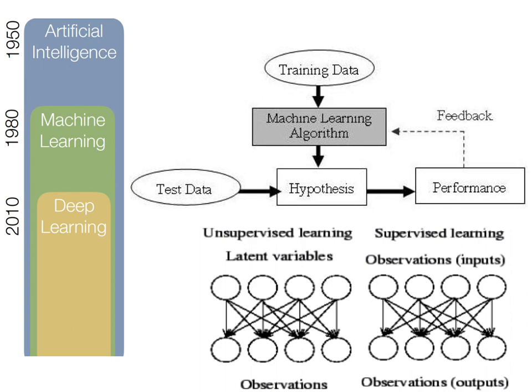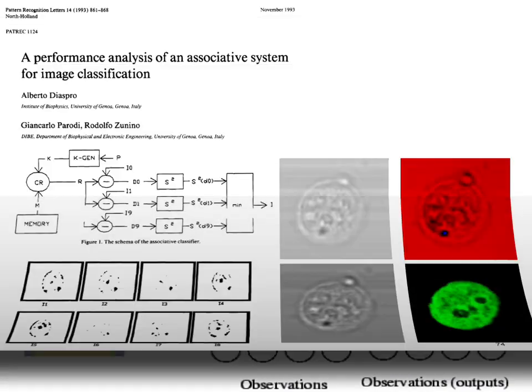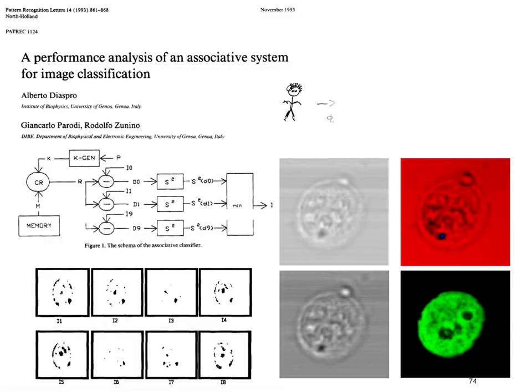Now we know how to train our algorithm using data. Well, many years ago we started with this concept. It's very simple. We call this maybe pattern analysis. We wanted to define some patterns in the sample in order to recognize different samples by a simplified decomposition of the elements inside. For example, in my case, many years ago, we used associative memories, a nice way for getting patterns.